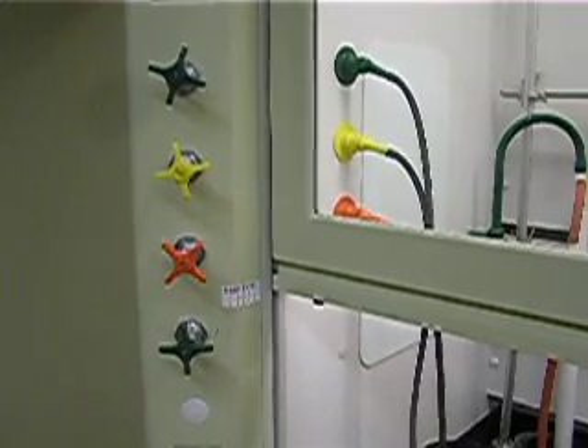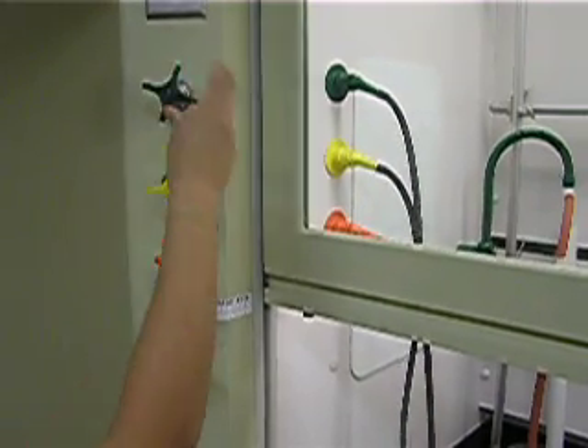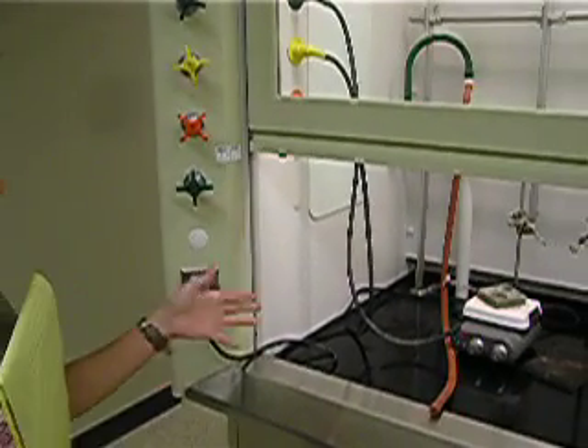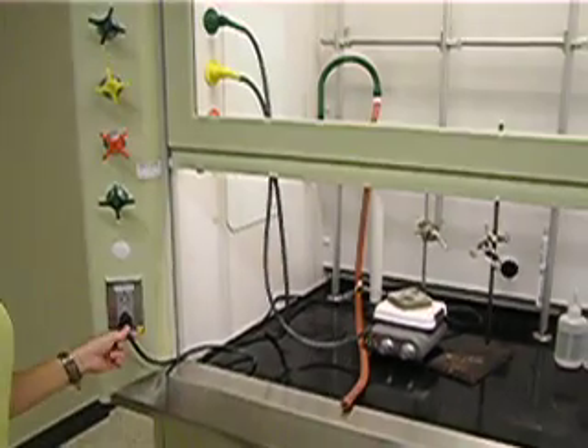When using all of these valves, close it just enough to where it stops — don't overturn it or force it. At the end of the experiment, make sure to have your hot plate off but do not unplug it.